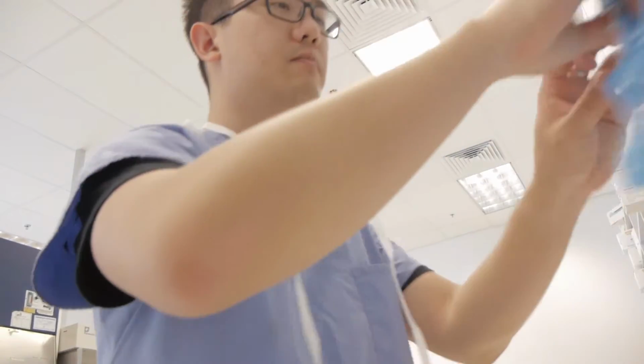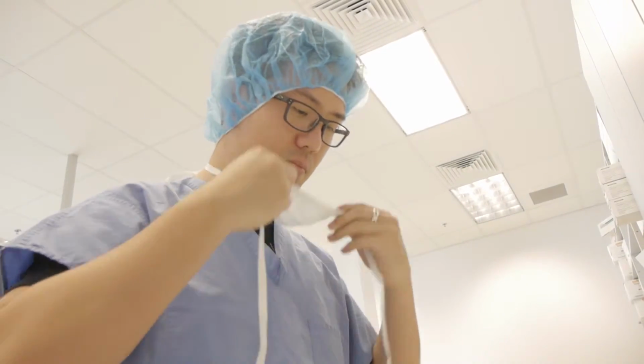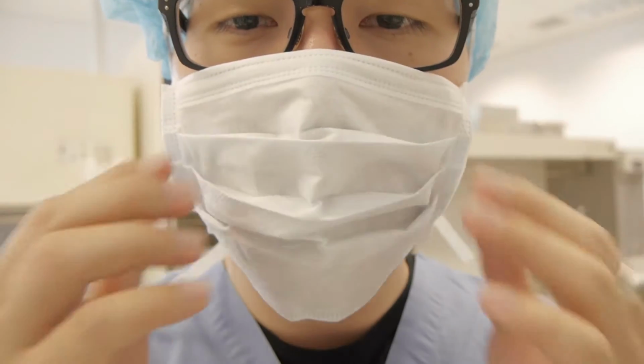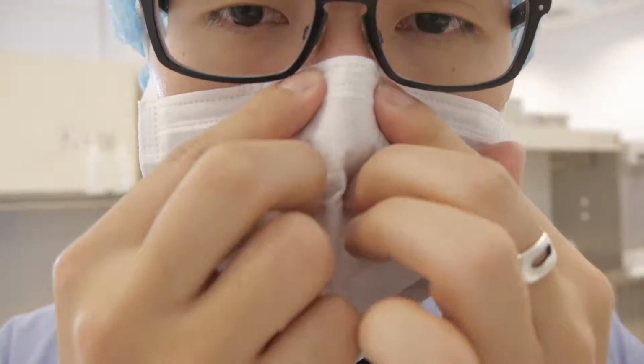Next, you will put on a hair cover and then a mask. If appropriate, use a cover for your beard as well. Ensure the metal piece on the mask closely conforms to the shape of your nose.